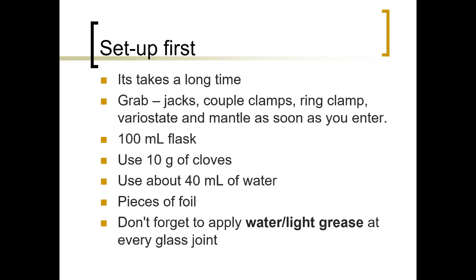Now, when you get into the lab, immediately get started, because this extraction and steam distillation can take a very long time if you don't get ready. I would say within the first 10 to 15 minutes of the lab, if you're not already set up and have everything going, you may run out of time. So make sure you have all the jacks you need in the hood, all the clamps, your ring stands, your heating mantles, anything you need to get started, before about 10 or 15 minutes into lab so that you're on time.